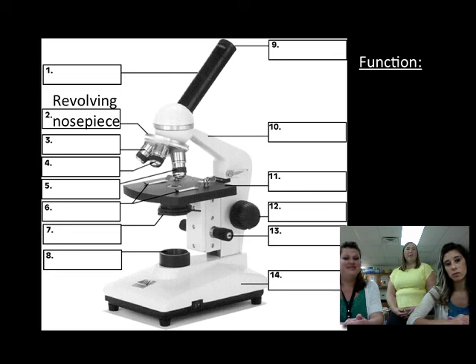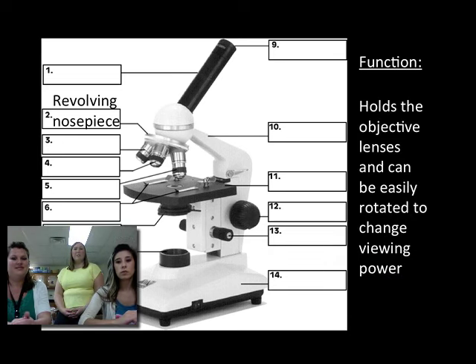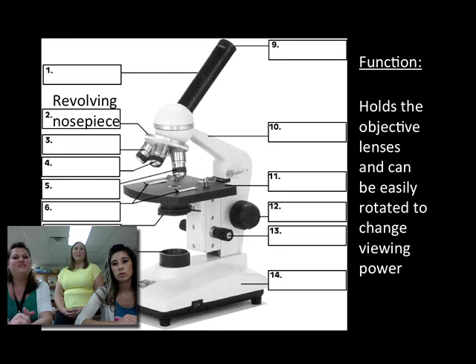The second one is the revolving nose piece. Its function is to hold the objective lens so it can be easily rotated to change the viewing power.